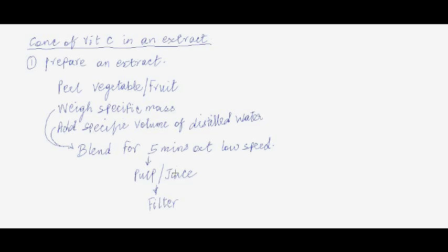Now once this is filtered, for a specific period of time, maybe till no more juice drips out, maybe for 10 minutes, but somehow standardize this. And once you finish this, you will get something called the residue, which has no further use for this experiment, so we can just forget about that, and we'll be left with the filtrate.